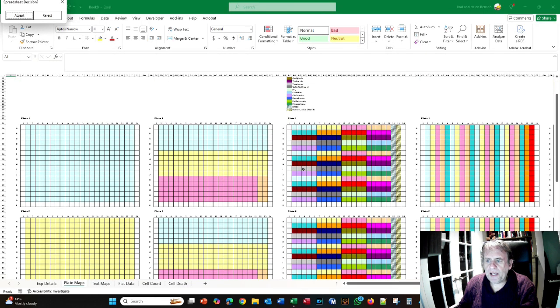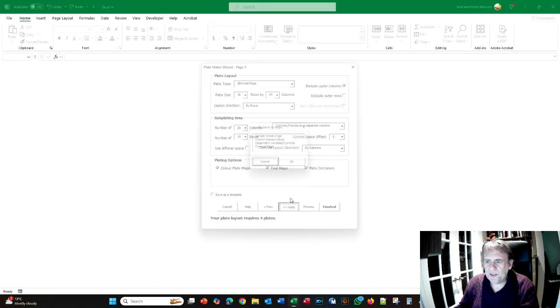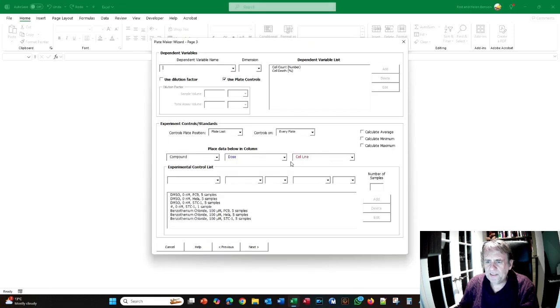That now we have, in fact, our 3 cell lines. Now, interestingly enough, do you see what I've done here? I've actually used the wrong name for STC1. So let's just fix that very quickly. So I go reject. I go to this one. I go to STC1. I need to change that to STC1 is how it's done. I go edit, and it's changed it there. I need to change it a second time, so just change it here and go edit.